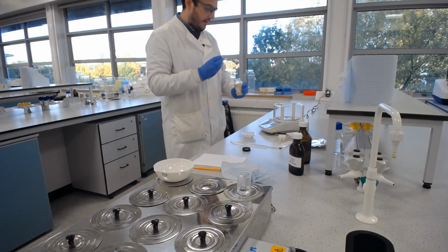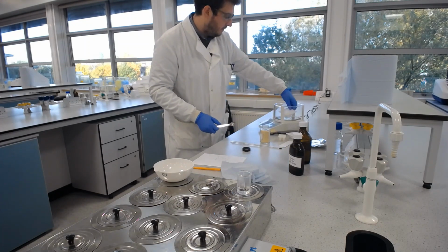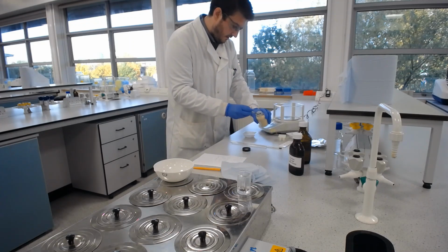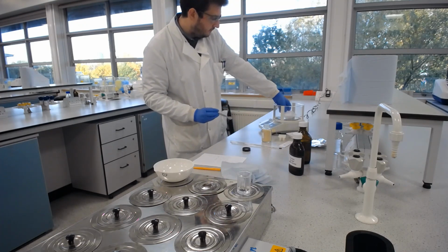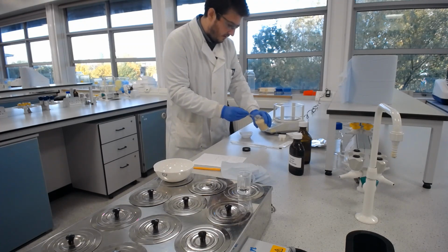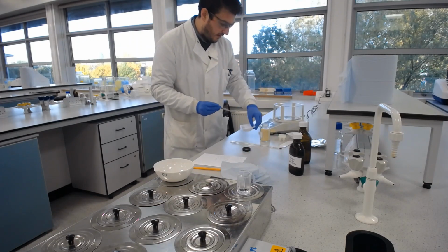I need to put 1.6 grams of gelatin into there. Again, I have no idea what 1.6 grams of gelatin looks like exactly, so we'll just take a rough mass. That's about half of what I need. So let's put about the same again. 2 grams, so I need another 400 milligrams. Let's see what we get. 4.27.